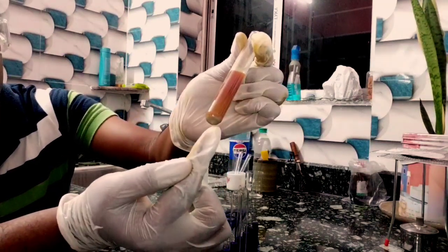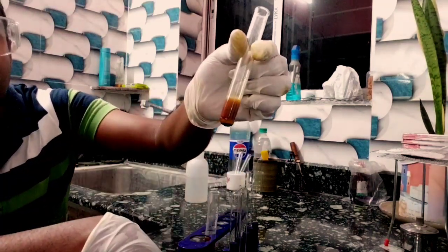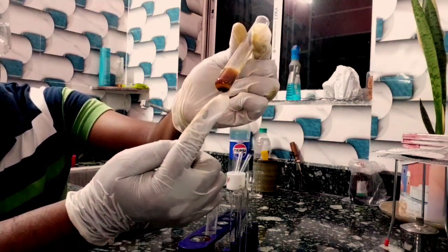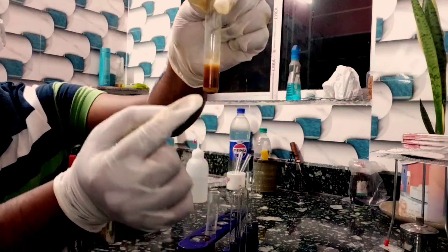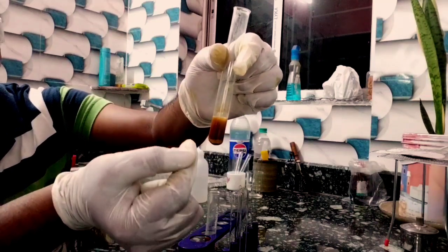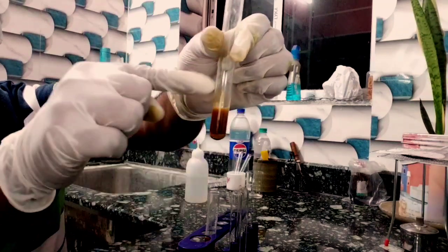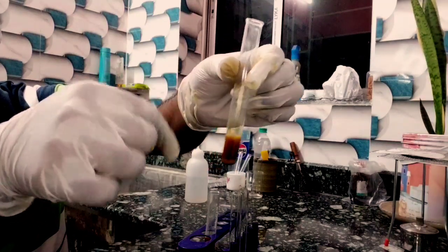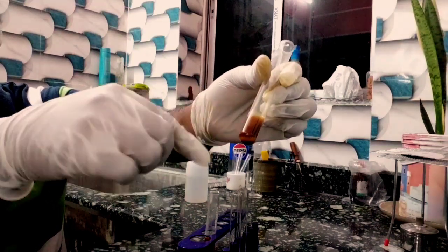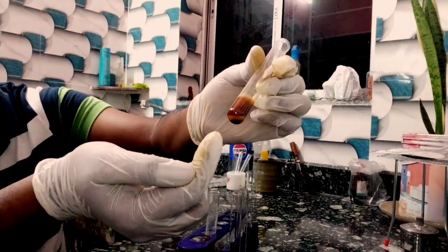The lower part is cuprous iodide. In this case, I directly added solid KI. See here also the off-white precipitate of cuprous iodide, and see, the color is a little denser because here I directly added KI in solid form. Here also there is a little brown color due to the iodine vapor. The upper part is iodine solution, and colorless K2SO4 is also there, and the lower part is Cu2I2.